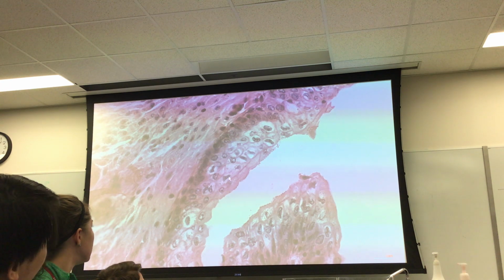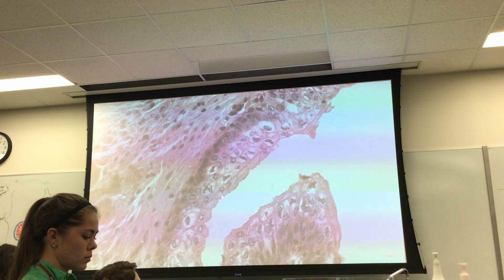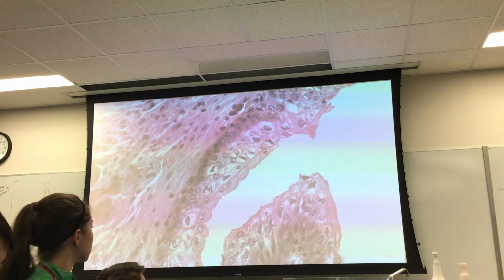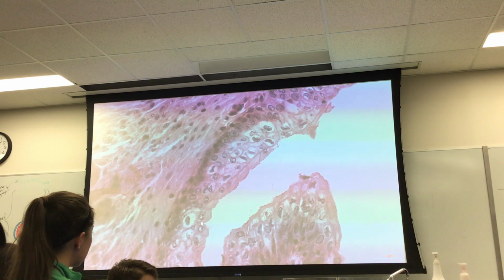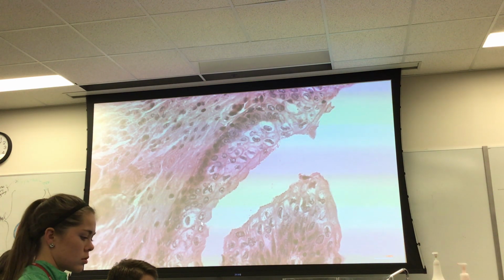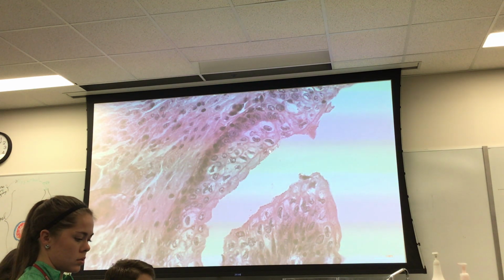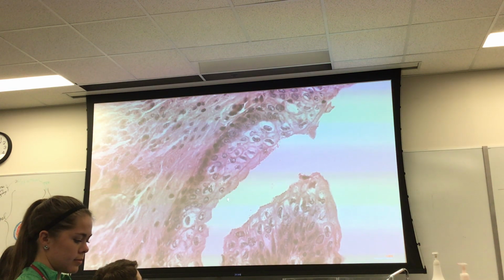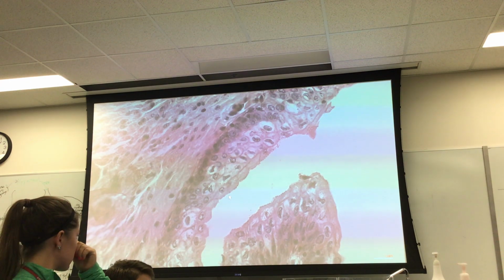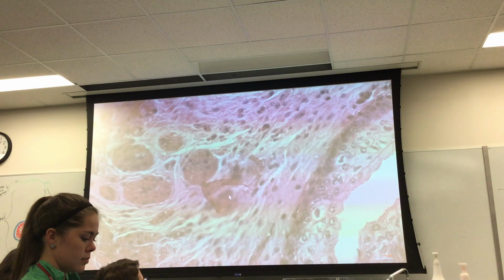Here's this tissue right here. These cells are not squamous. You may say, oh, that looks good to me. Well, the problem is the nuclei. You don't have oval nuclei in a squamous setting. They're squished. So I'm going with transitional for this one, simply because these are those cap cells that sit along the surface. Again, I'm hopefully helping you.